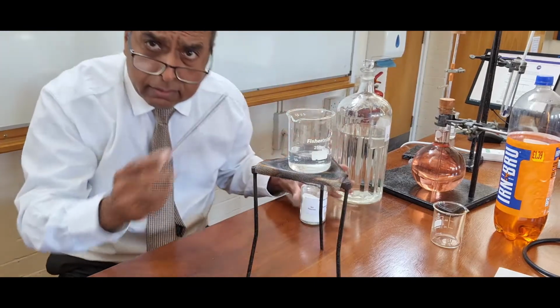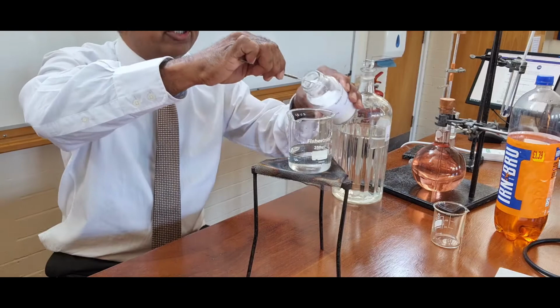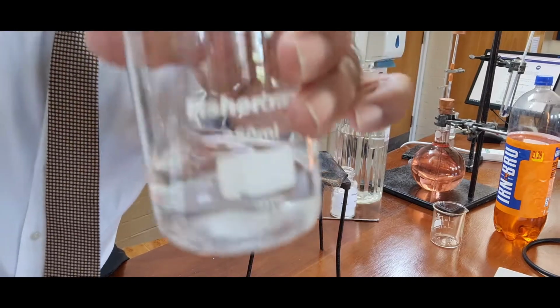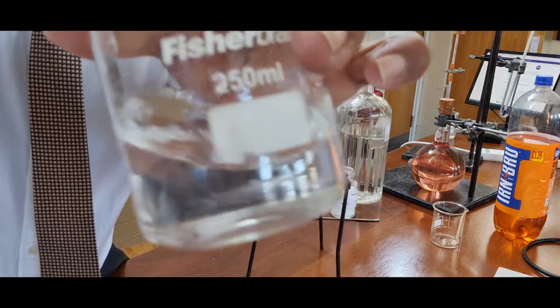And that's salty water. It can dissolve more salt than the amount of salt I put in there because the solubility is more. I've not exceeded the solubility.